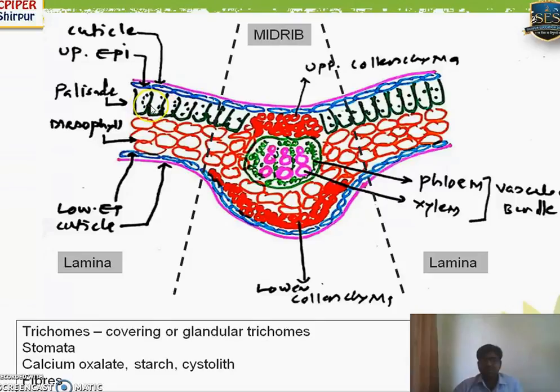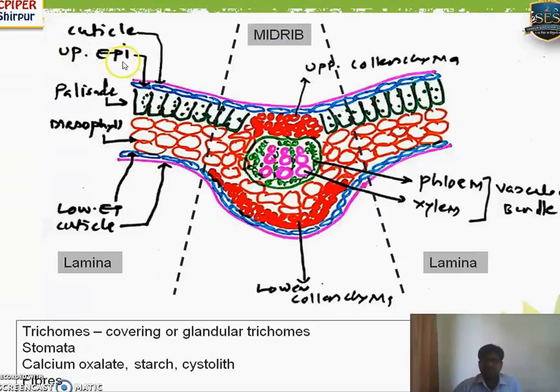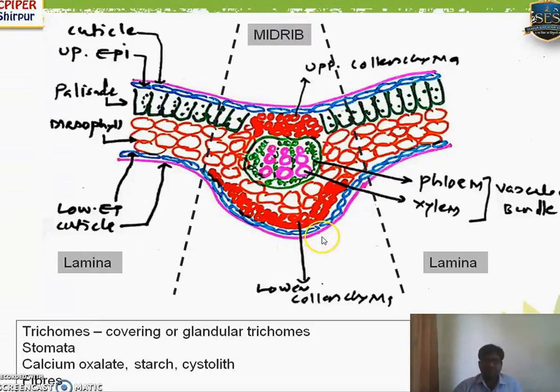Palisade cells may be a single layer, double layer, or triple layer varying with the example. Mesophyll cells are polygonal parenchymatous cells which are cellulosic and show loosely arranged cells with intercellular spaces. This is followed by the lower epidermis, having similar characteristics to the upper epidermis, and followed by a cuticle. In the midrib region it shows the same cuticle and epidermis extending from the laminar region.